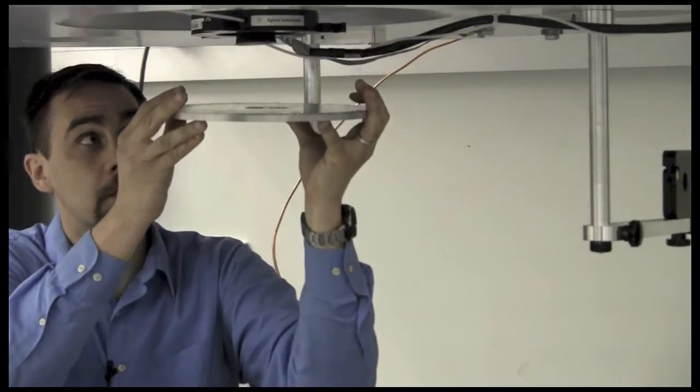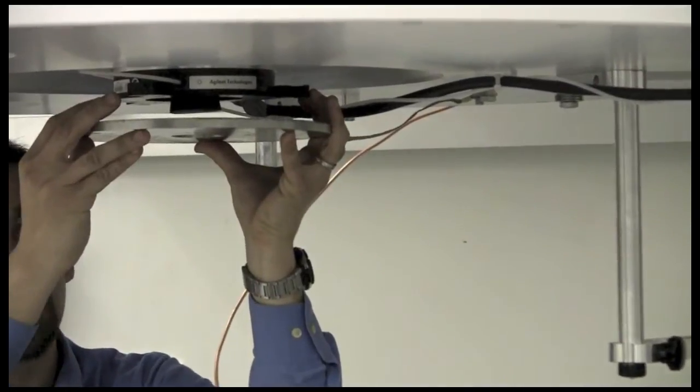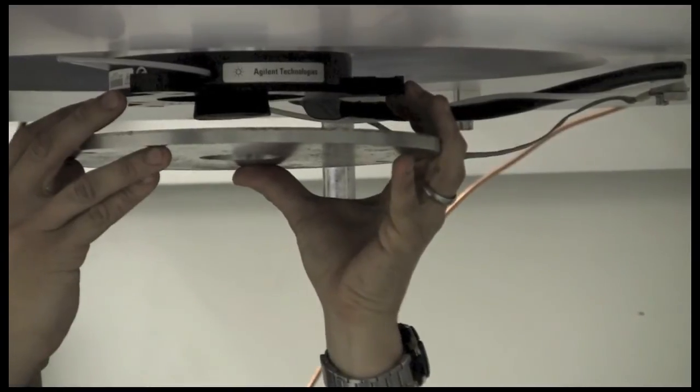So if I push it up near the bore of the magnet and I let go, it's going to be opposed by the force of the magnet as gravity tries to pull it down.